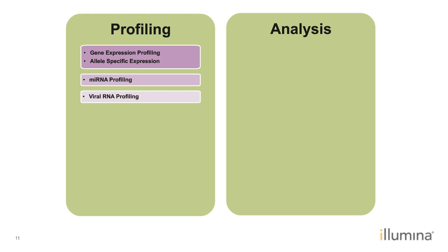For mRNA, we can take a look at gene expression profiling or allele-specific profiling. If we're looking at mRNA, we can count the different mRNA transcripts within different cells or treatment groups. We can also do this for viral RNA.